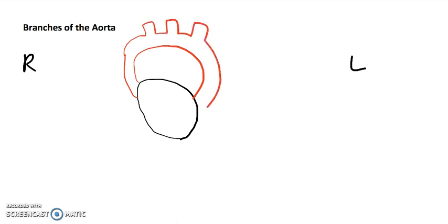And the vessel that exits from the left side of circulation, approximately, and then it goes, we have a few pathways up here, and this goes down to tissue below the heart. So this vessel here, this is the aorta, carries oxygenated blood. This part up here where blood's traveling up, we call this the ascending part. So we can call this the ascending aorta.